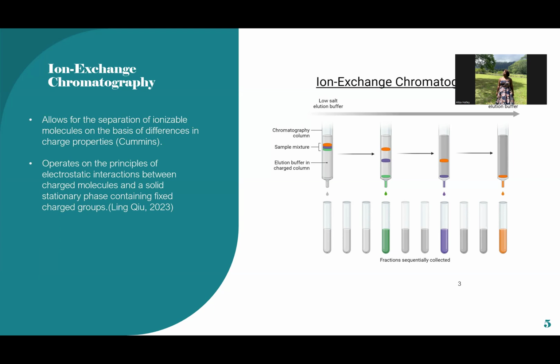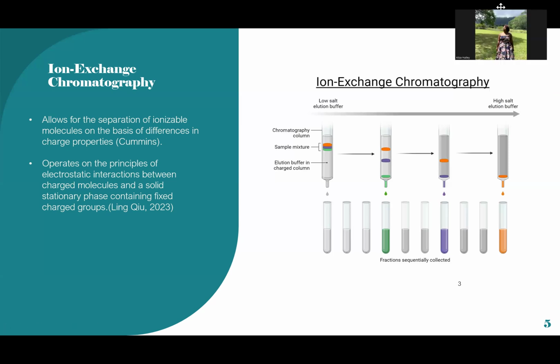This particular technique allows for the separation of ionizable molecules on the basis of differences in charge properties, so ions. And it operates on the principles of electrostatic interactions between charged molecules and a solid stationary phase containing fixed charge groups.